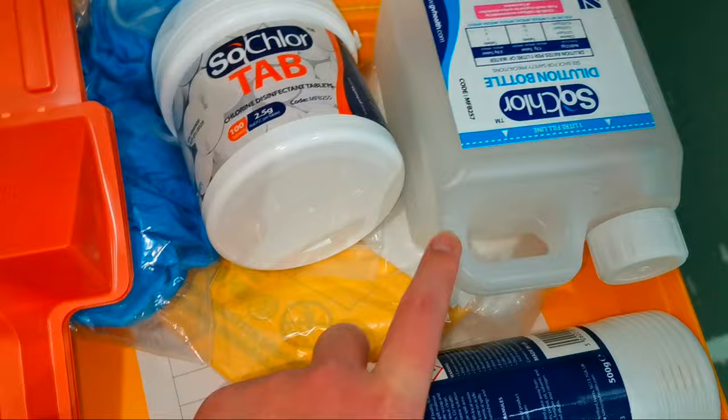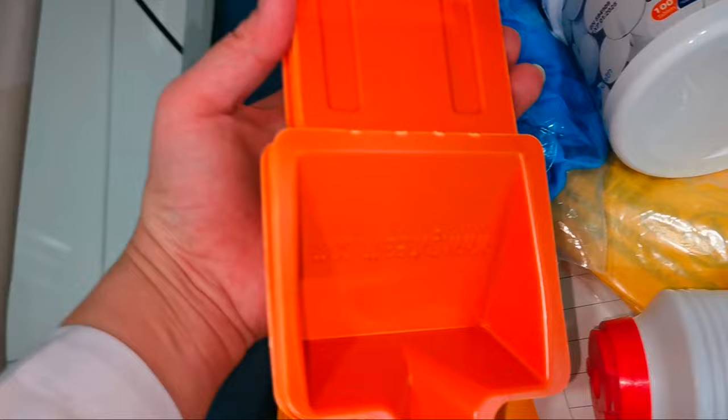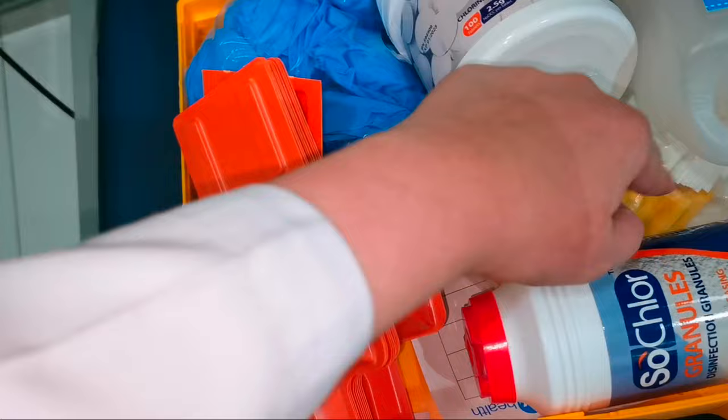We have chlorine tablets, dilution bottle, chlorine granules, scoops and scrapers, gloves and waste bags.